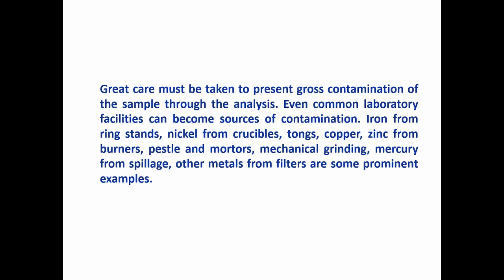You may not be aware, but it happens. There may be other metals, and sometimes the filter papers we use may also contain particular elements. So I can simply say that even common laboratory processes can become sources of contamination, and we have to be very, very careful with respect to contamination from different laboratory sources.